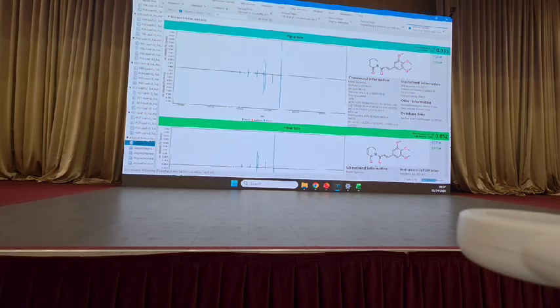And since we know this is a Piper plant, it's very likely that it should have this Piper-related alkaloid. And we can use our expert knowledge. It's a Piper plant. This Piper alkaloid has been reported in Piper species before. There's a good chance that this is actually the molecule. But at the end of the day, the best thing to do is confirm it either with isolation and NMR, or with a purchased standard and just run it yourself on the instrument.